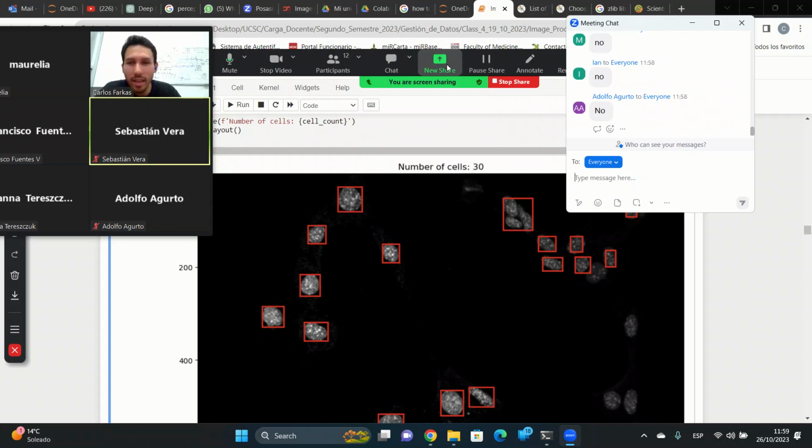So basically, this algorithm is far away from reality. We need to work on that. That brings us to, unfortunately, deep learning and machine learning.